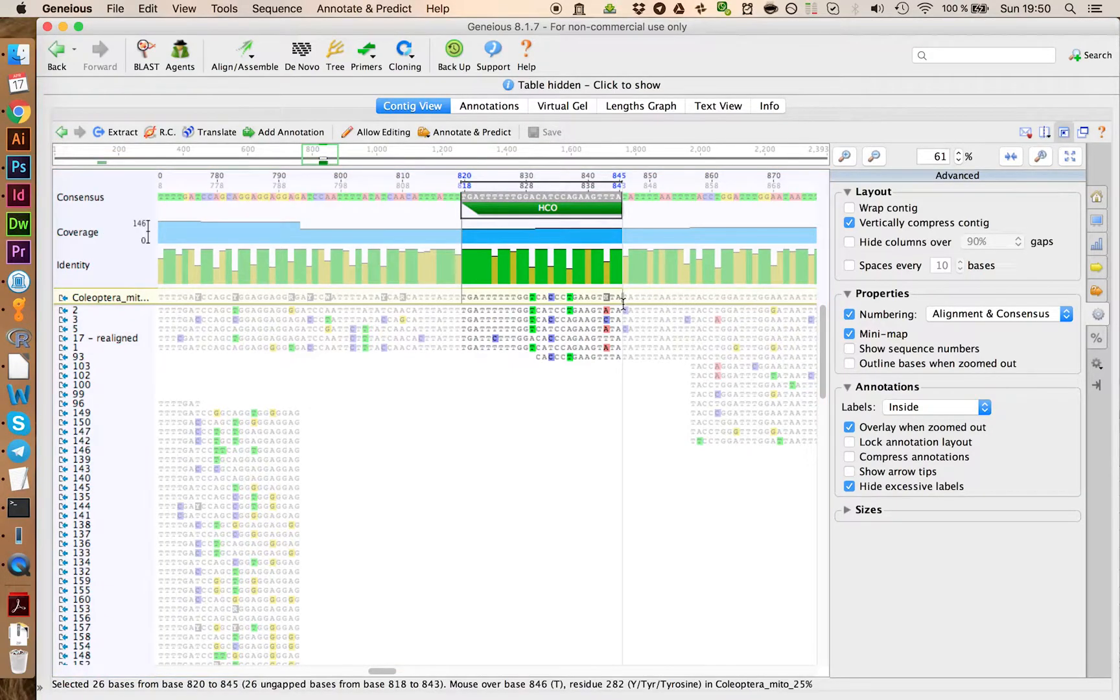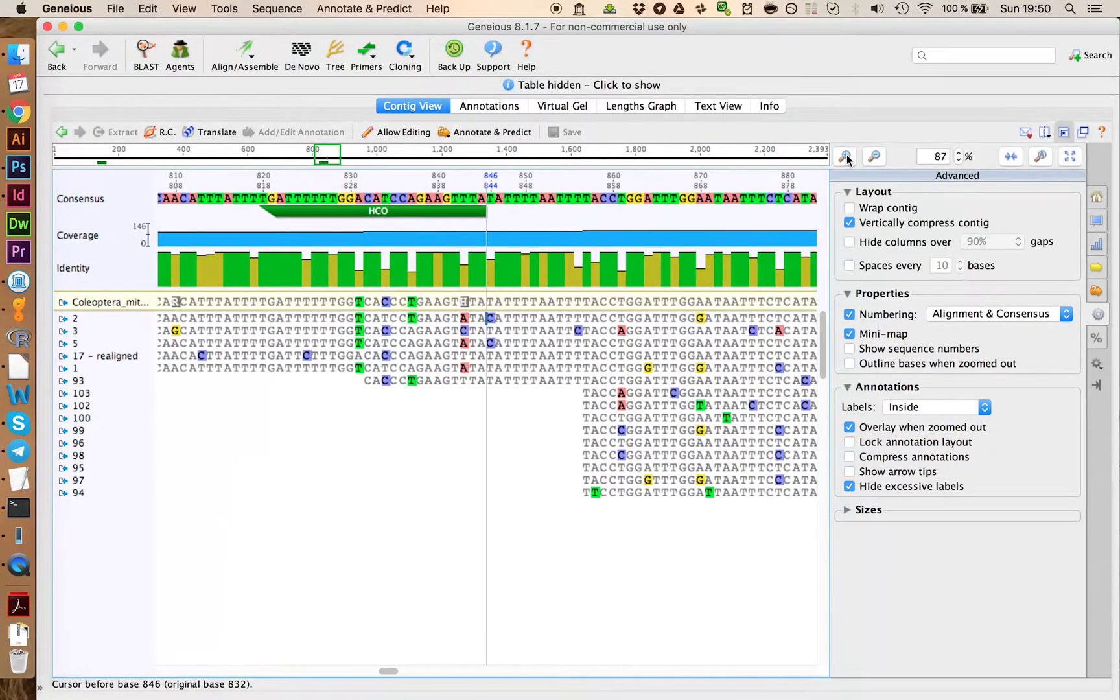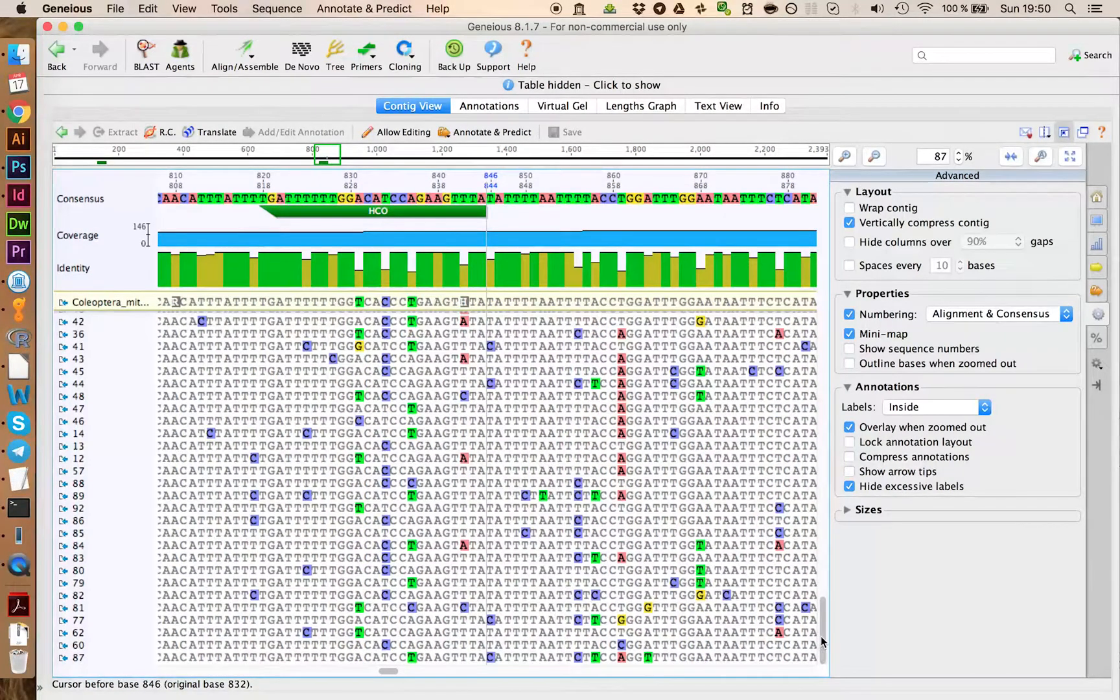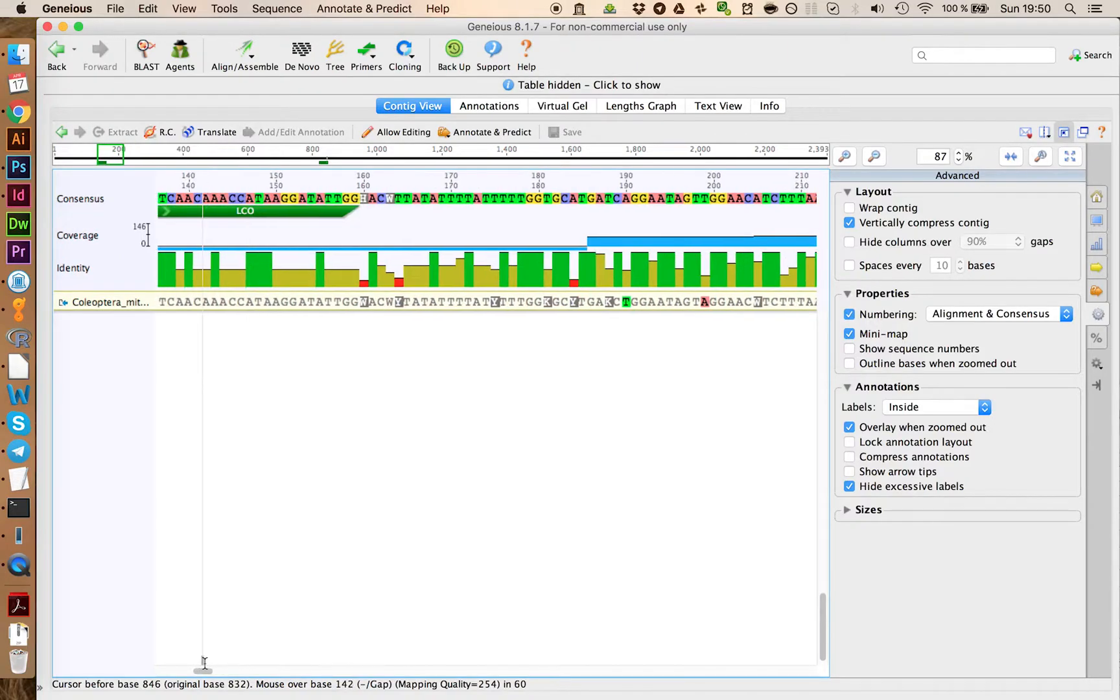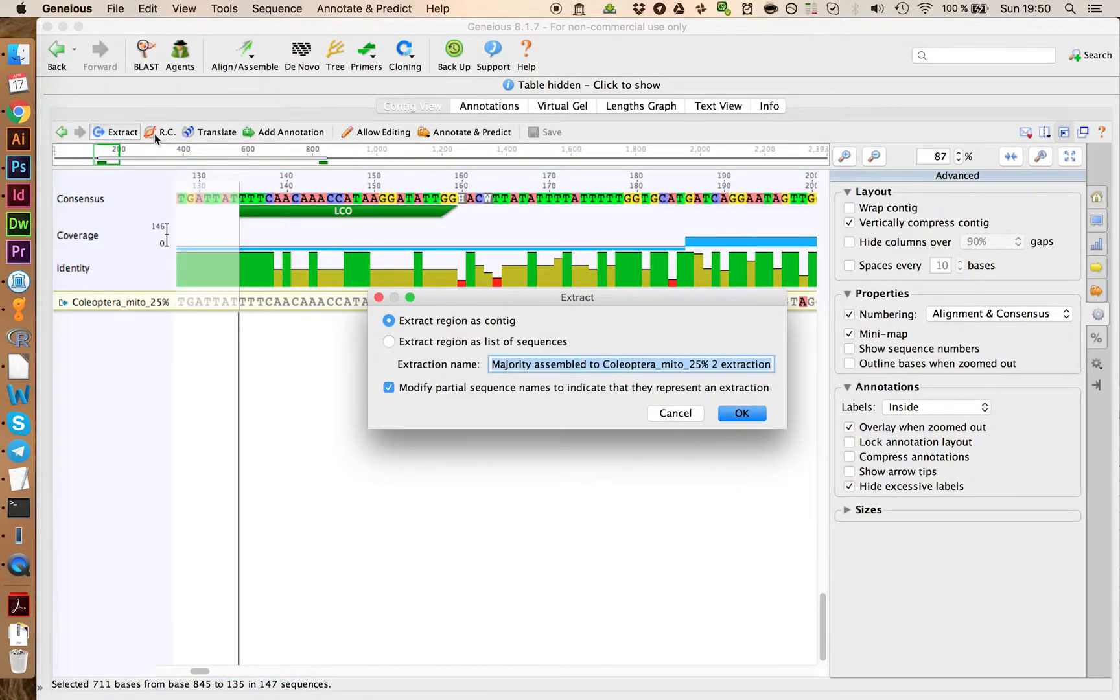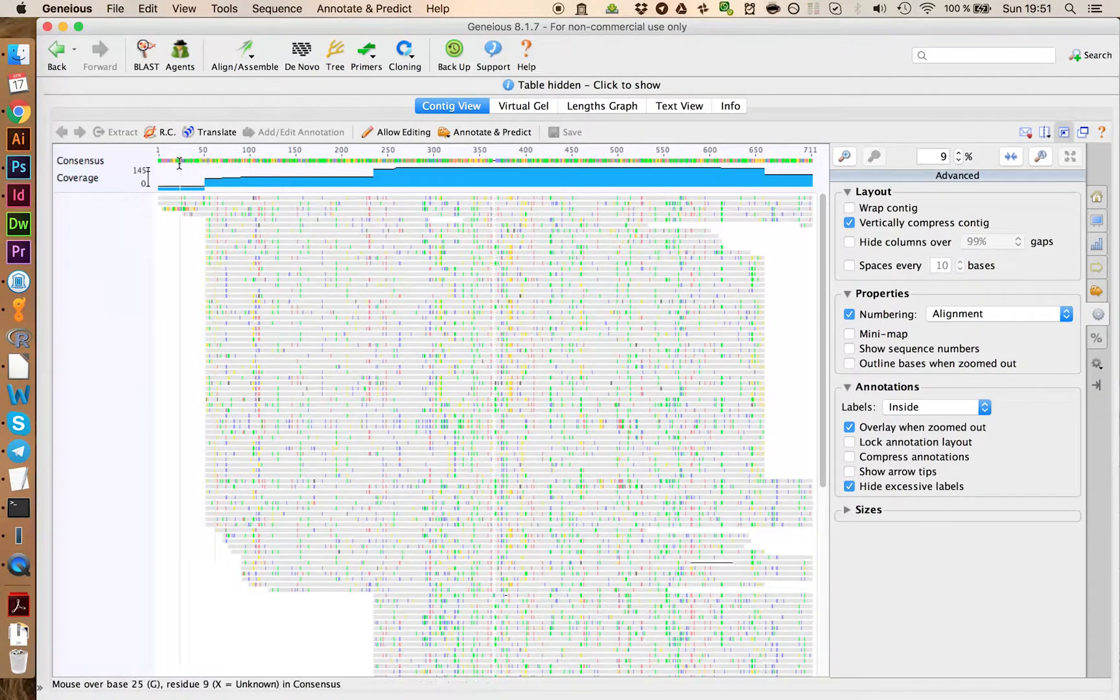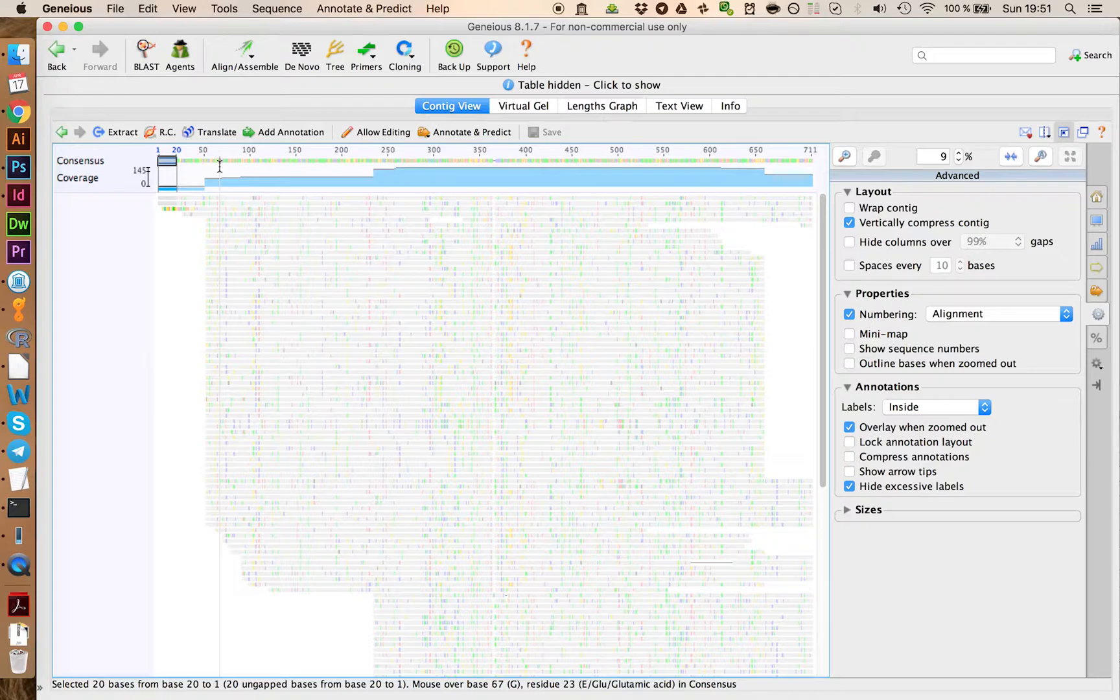And we're going to save the whole document. Next, you want to put your cursor right below the reference sequence on this place here. And then you go down completely and to the other primer. In this case, we want to extract the whole region including both primer sequences. So we're going to go and extract and let's call this one Coleoptera extraction.